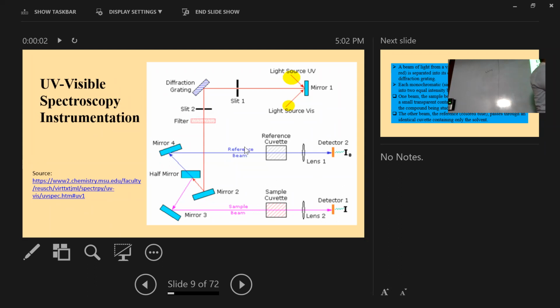But if I go to a little bit thicker region, and I even have the option for even thicker, now you cannot see anything. How did I make it? This is just a plastic bag, a little bit thicker. I have cut one part.